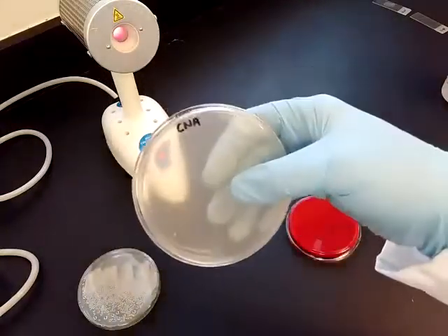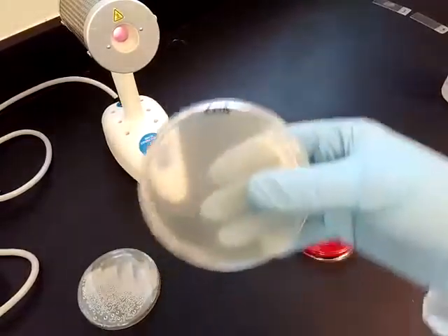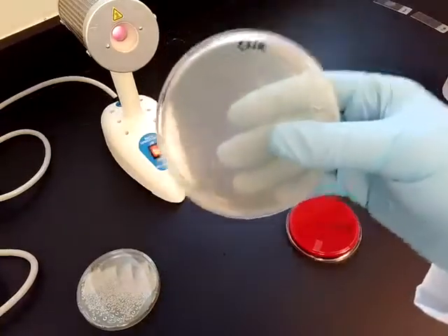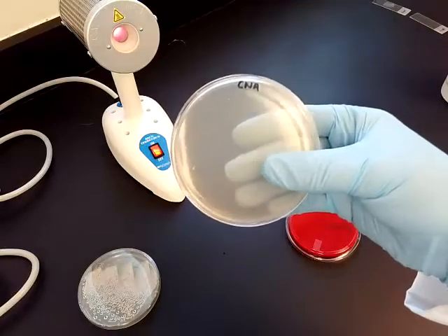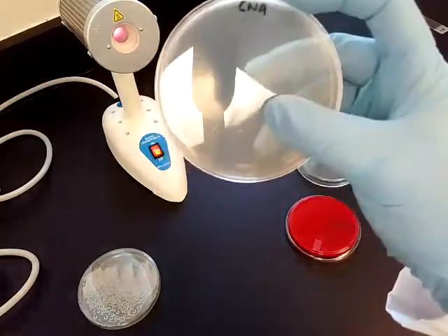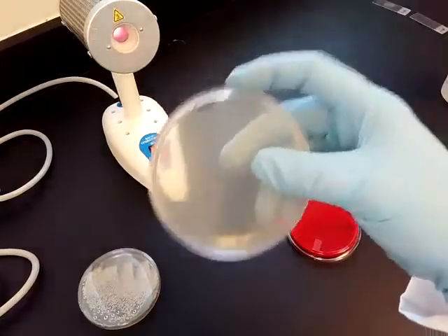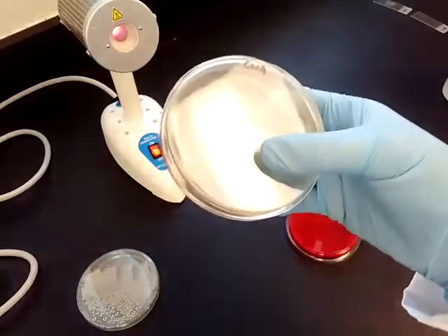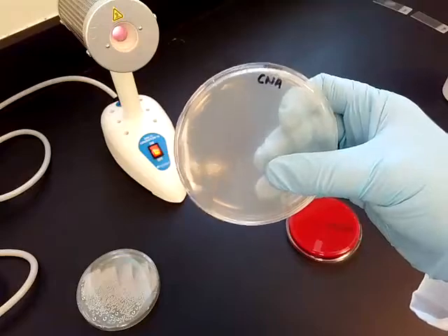And of course, there's exceptions to all of these. Some gram-negatives will grow on here, some gram-positives will also grow on MacConkey, but for the most part, it does a pretty good job at reducing the number of microorganisms that we're looking at so that we can get a faster diagnosis. This one usually is accompanied with blood. So usually you have CNA with blood agar. This one is just CNA on the surface. It is not differential unless you were to add blood to it. The blood would make it differential.